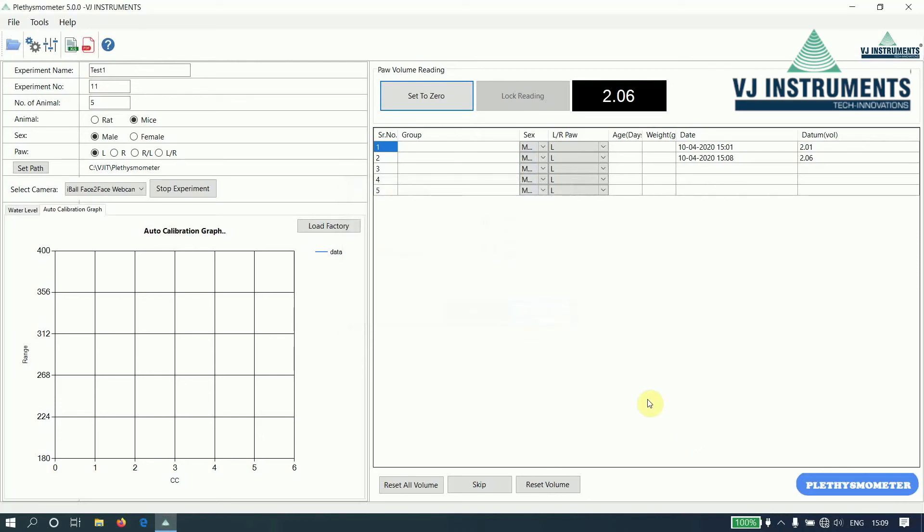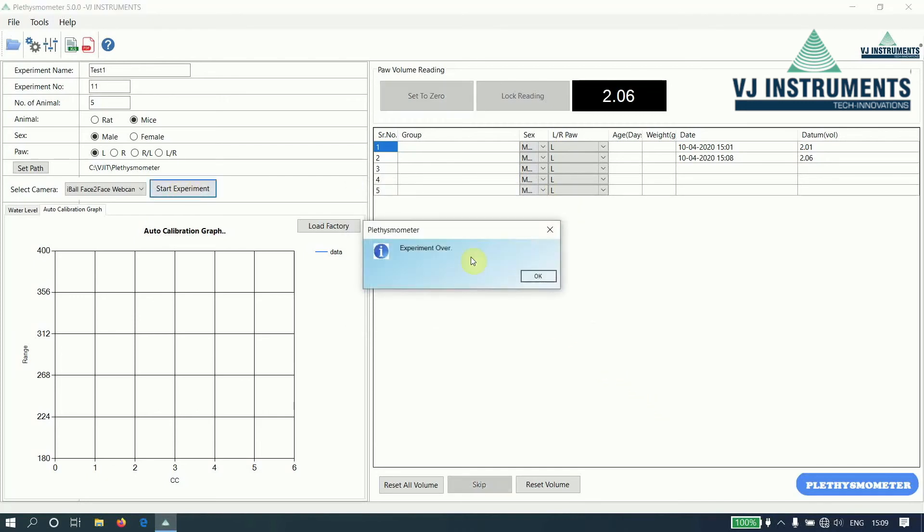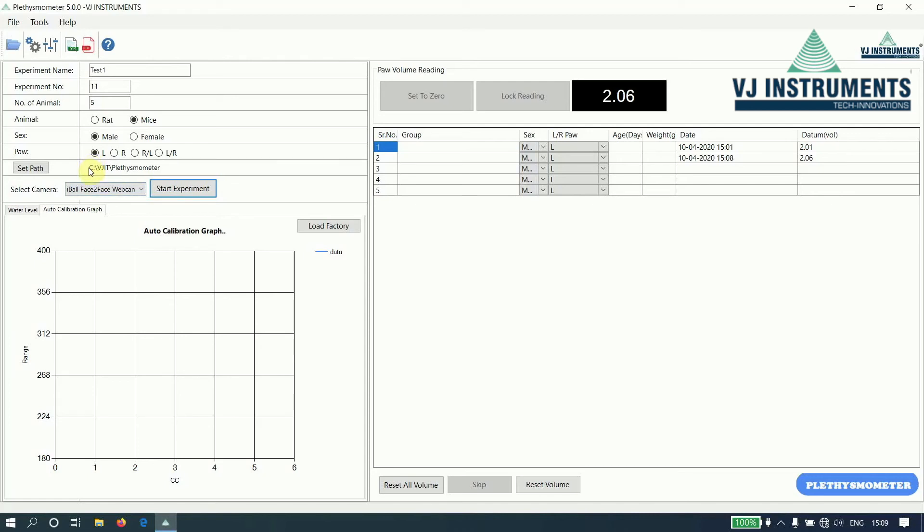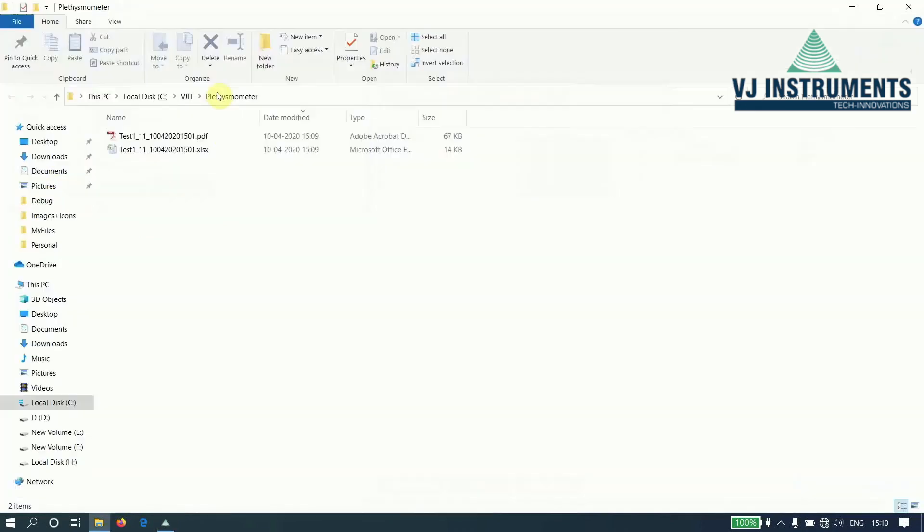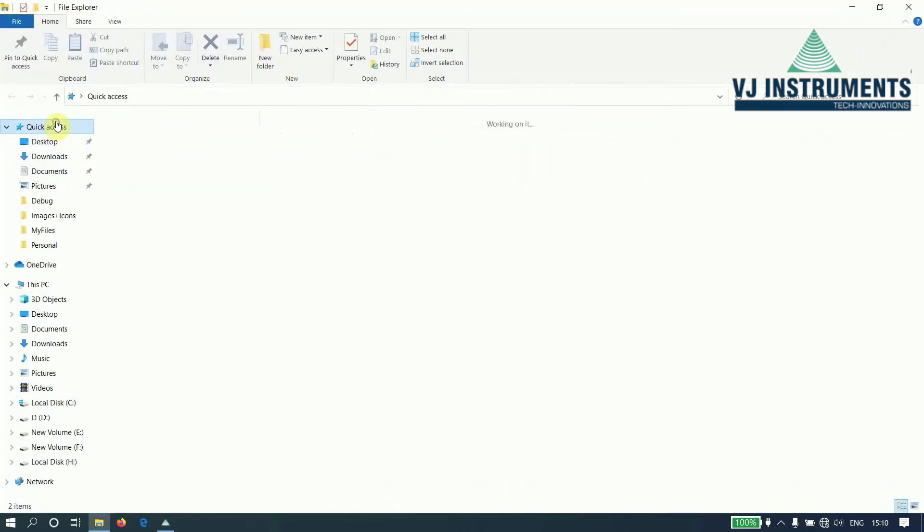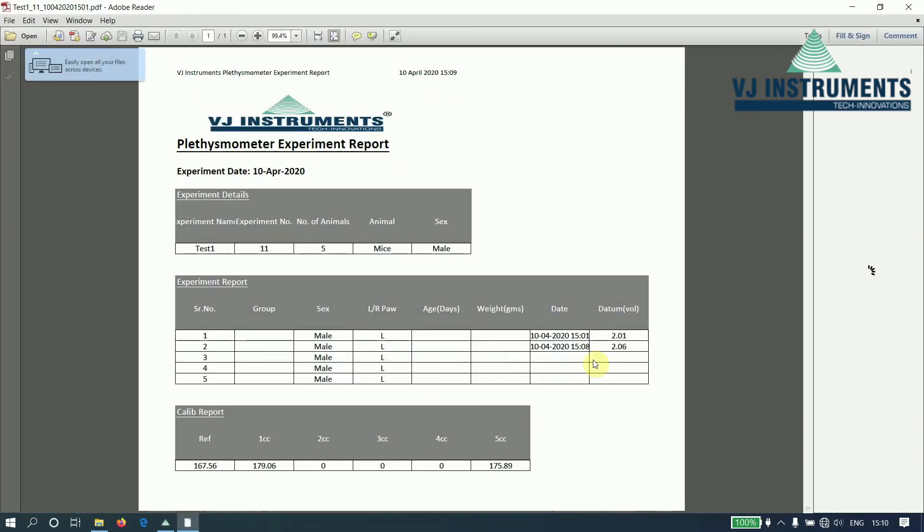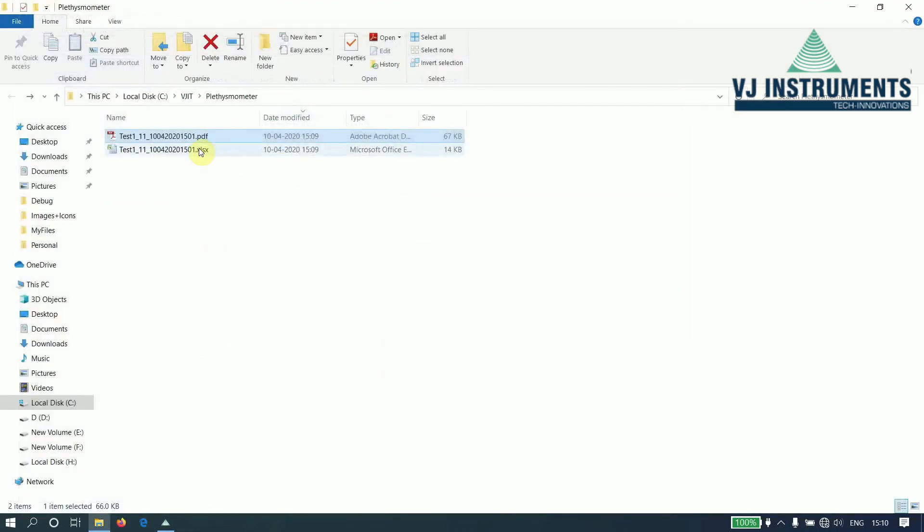Once the experiment is over, the experiment over message will be displayed. And the reports will be saved in this path: C VJIT Plethysmometer, or the path that we have set. Excel as well as PDF reports will be created. So this is the report, and this is the Excel report.